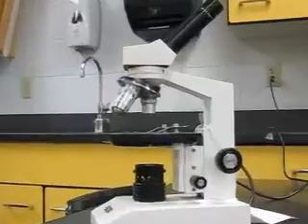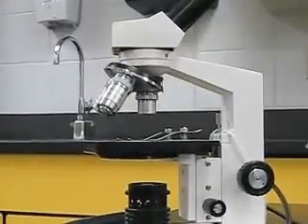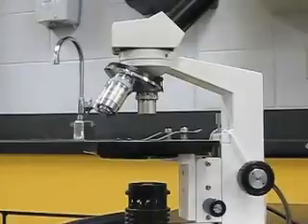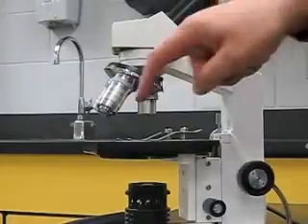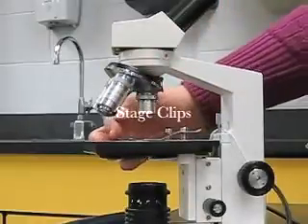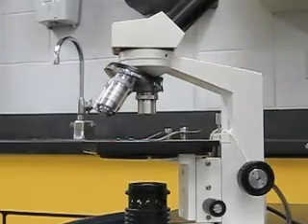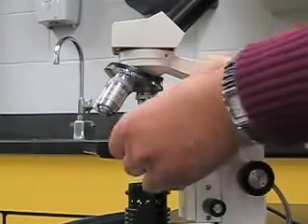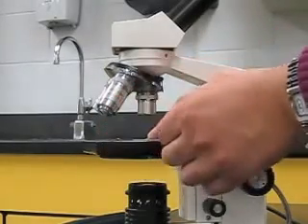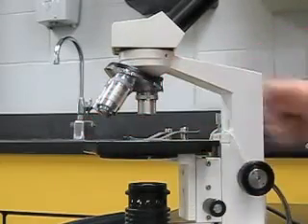There are 2 ways that are commonly seen on a microscope to hold the microscope slide. This microscope we're looking at has 2 stage clips. You can lift the stage clips up and place your microscope slide under the stage clip. Microscope slides can also be held into place using a mechanical arm. These arms are very convenient and make it easy to move around on your microscope slide.